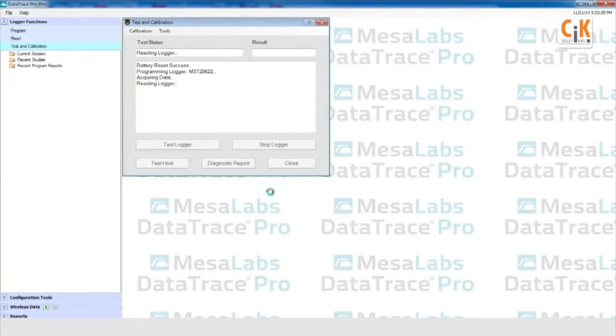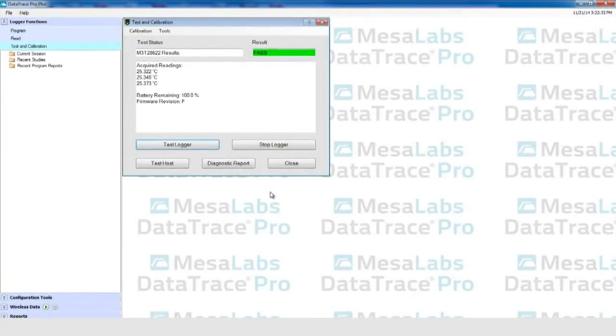The new battery is now successfully installed and the logger is now ready for use.